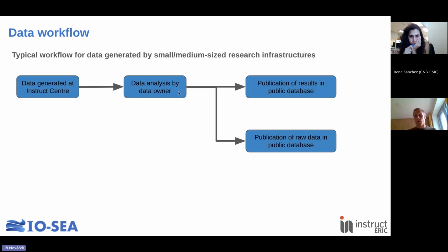They will analyze their data and produce the results, which in the case of cryo-microscopy will be cryo-EM maps that they will deposit to the database, together with the coordinates that they will deposit to PDB through OneDep maybe, and that is what they eventually need for publishing.